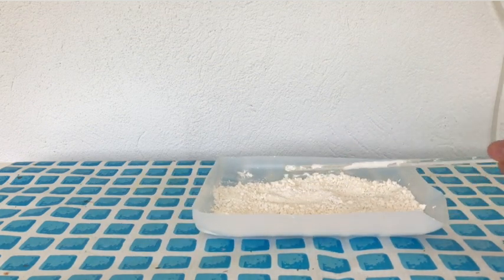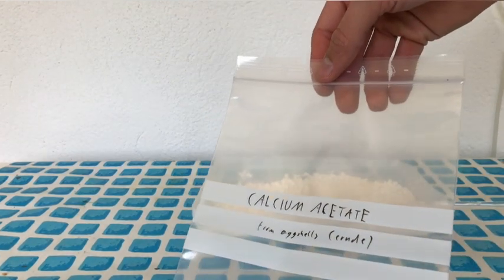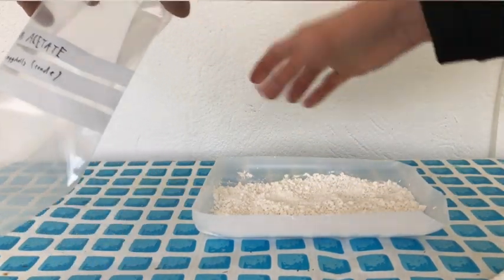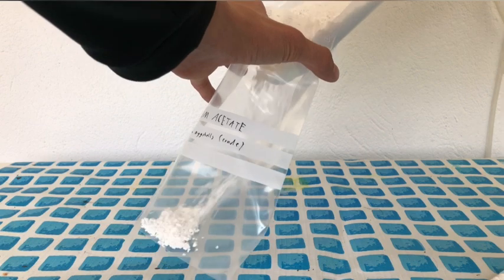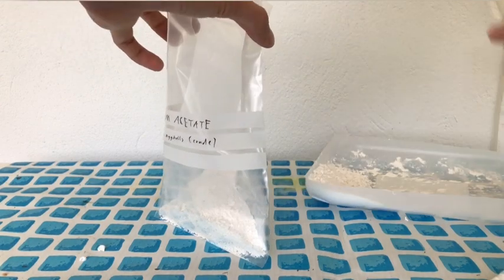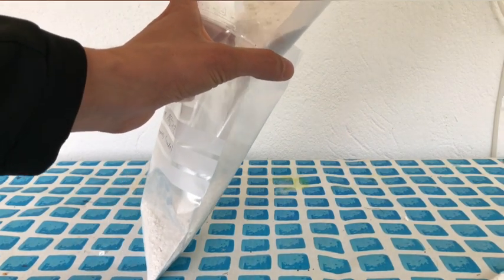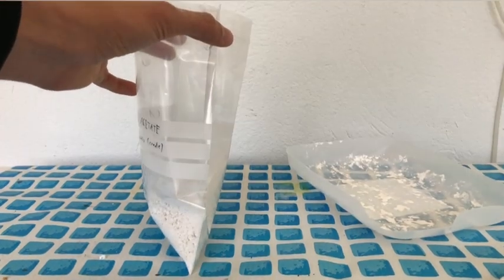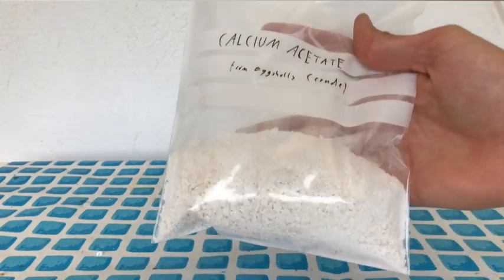Calcium acetate is definitely not pure and therefore we are only going to put it into a plastic bag and not into a fancy container. While filling this bag, I did not wear any gloves because calcium acetate isn't dangerous.